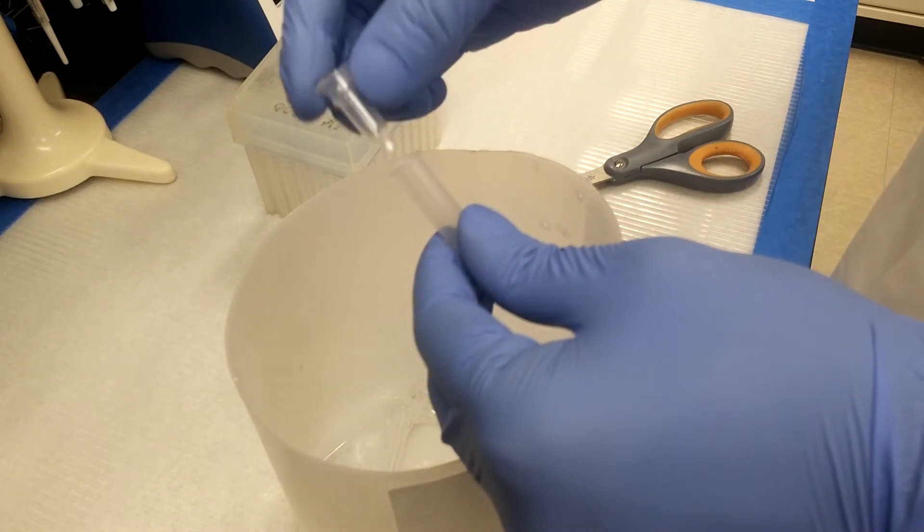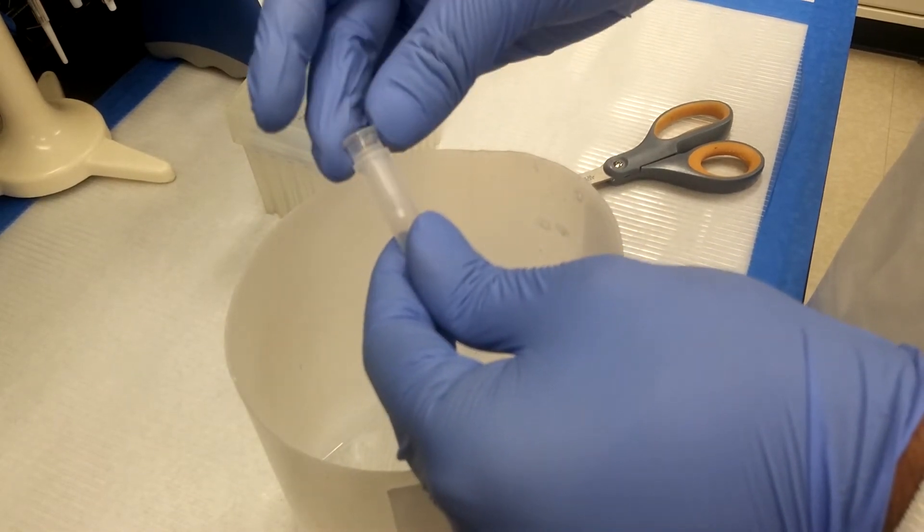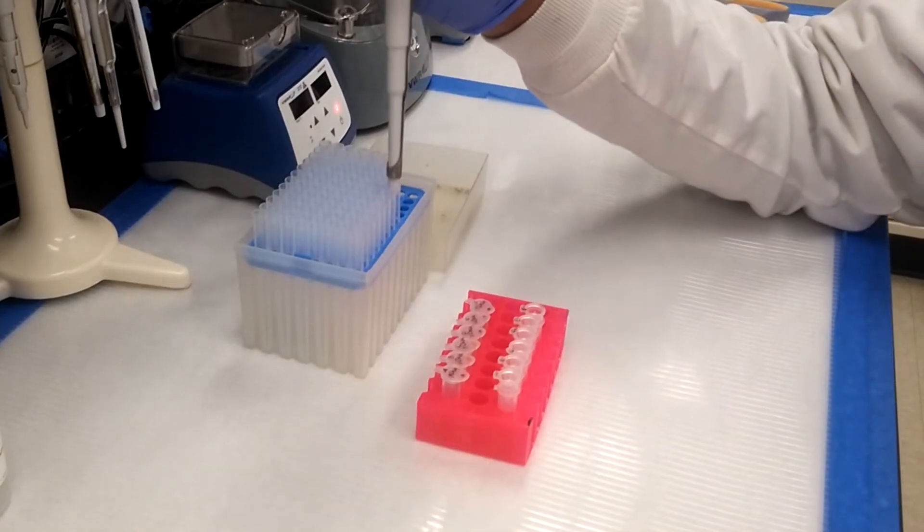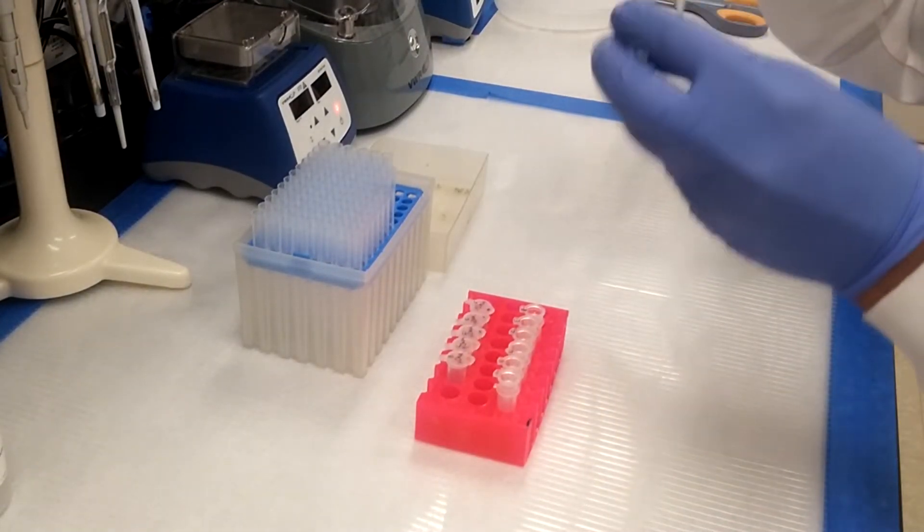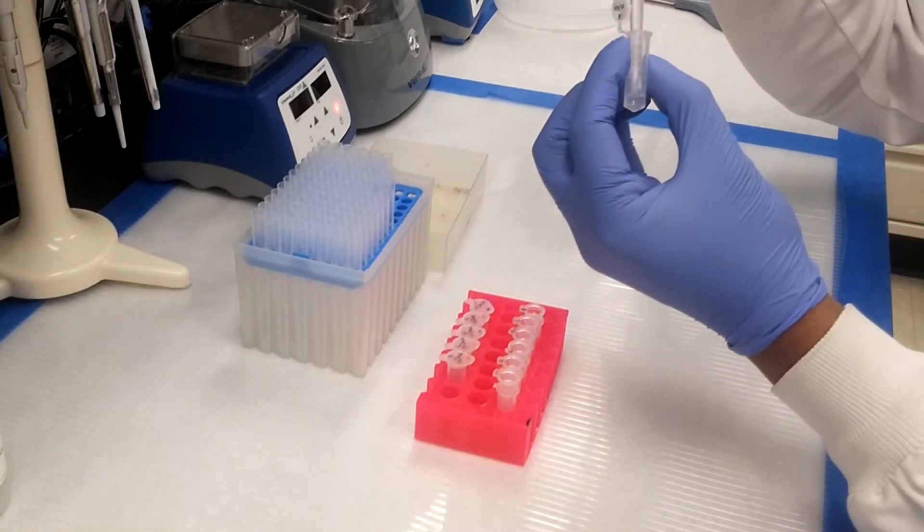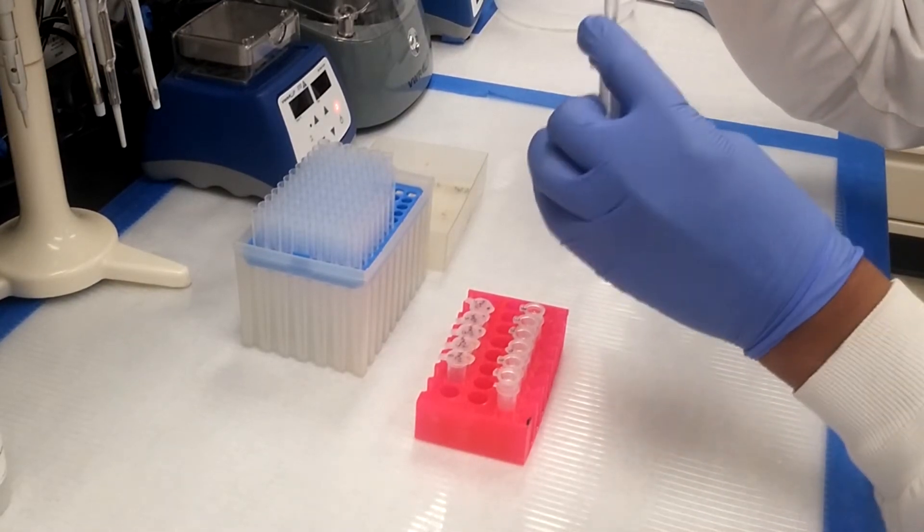8 filtration columns are labeled 1 through 8 and are placed in their corresponding collection columns. The samples, now about 700 microliters full, are then transferred from the 2 milliliter Eppendorf tubes to their corresponding filtration columns.